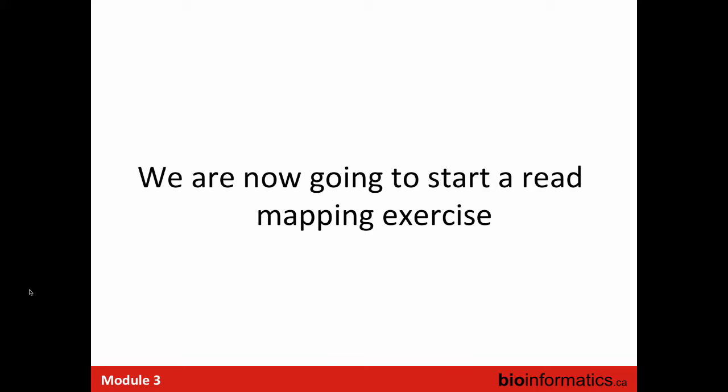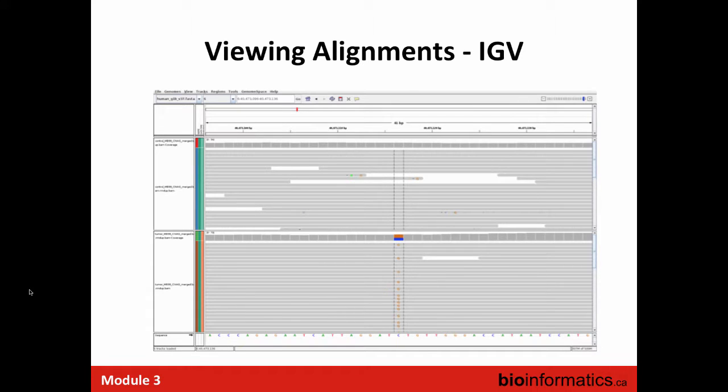This will come up in some of the other modules as well, when I talk about rearrangements, and when we talk about somatic mutations, I think tomorrow. So you're going to create a reference genome for each patient? Well, what we usually do with programs internally is this. Let's go back a few slides. In this case, we would look at this position. We might see that there's a C to G mutation, and this is all of the evidence for this mutation in the tumor. Then we would look at the same position in the normal, which is shown here, and see that there's no evidence for it. The program would be internally integrating all of this evidence, and it would say, OK, there's a somatic mutation, C to G, at this position.